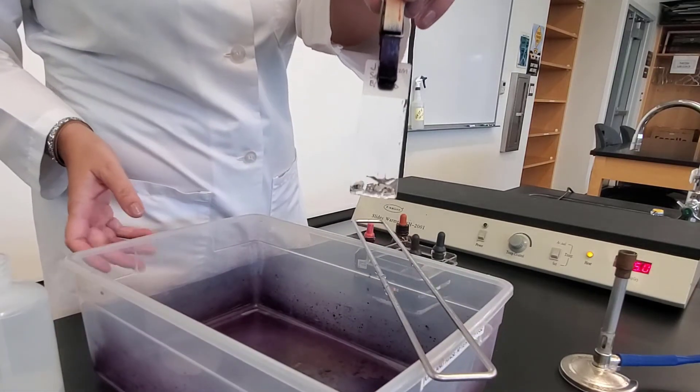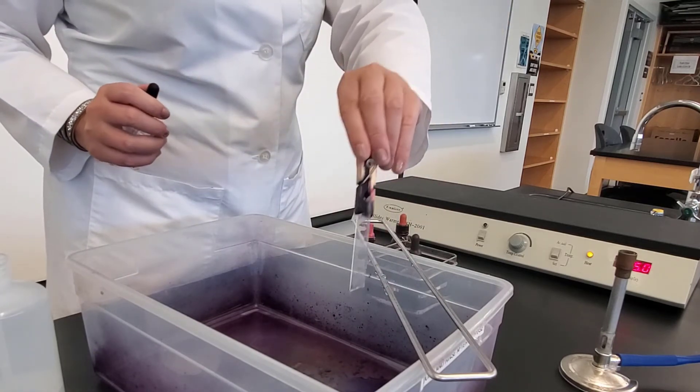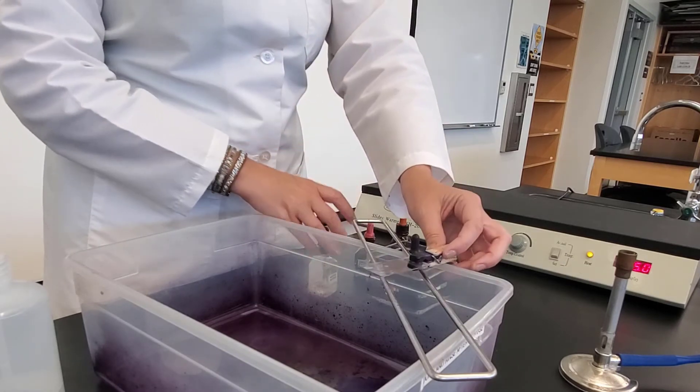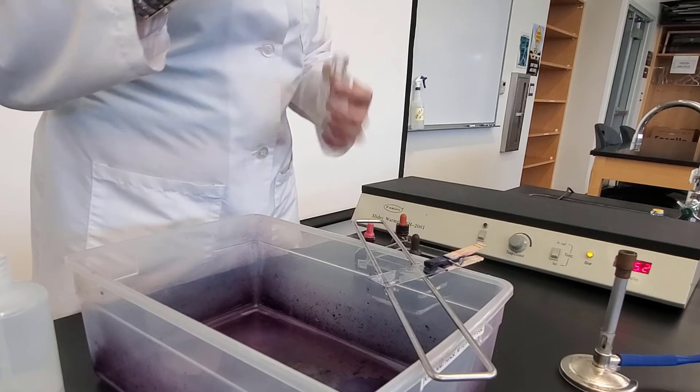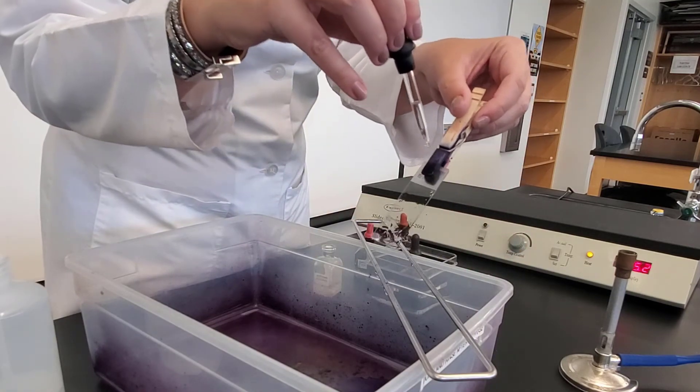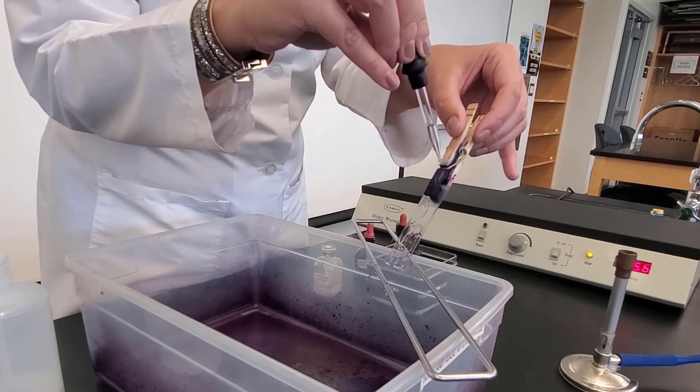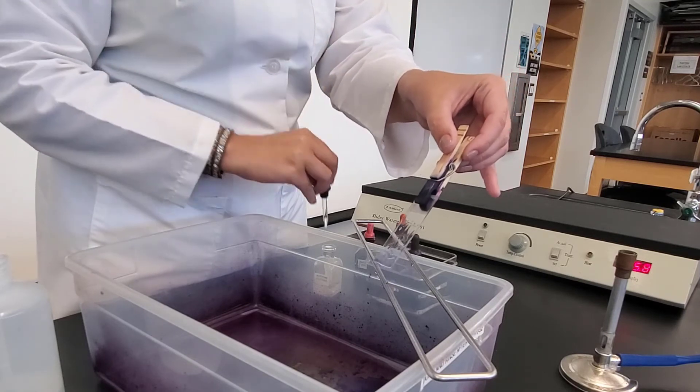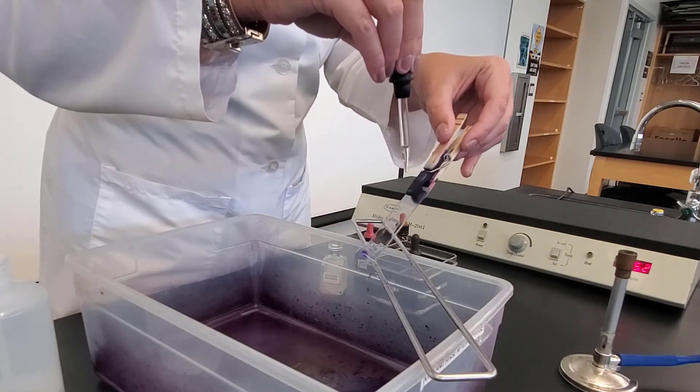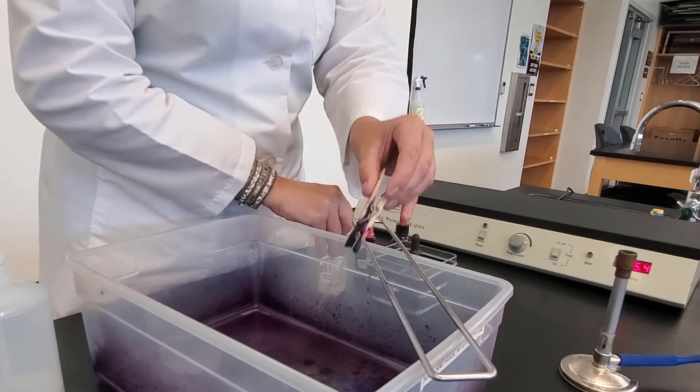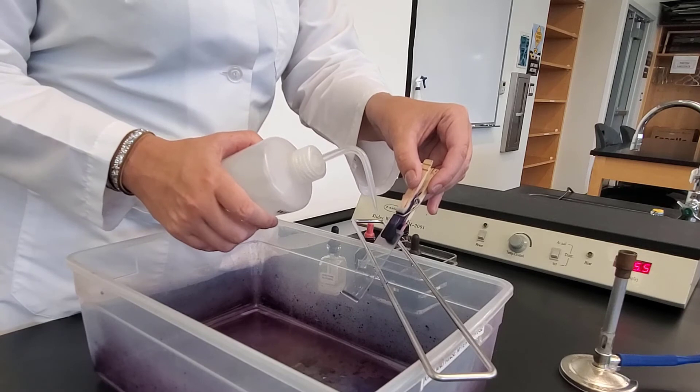Now, the next part of this is going to be the decolorization step. This is the most important step of the whole procedure. So what I want to do in this step, let me shake off the extra water, is that I want to add the decolorizer until the liquid coming off is clear. So I'm just going to add it. And as I do that, I see that the liquid coming off has some color to it. Shake off the excess. And then my liquid coming off is clear, so I'm going to stop. So once my liquid coming off is clear, I'm going to then rinse with water again.